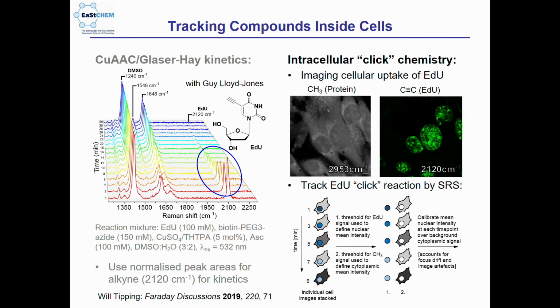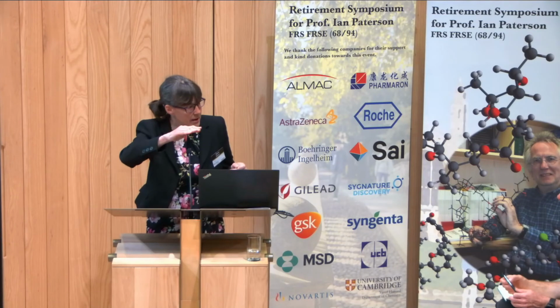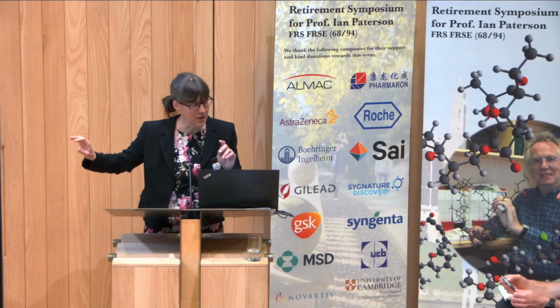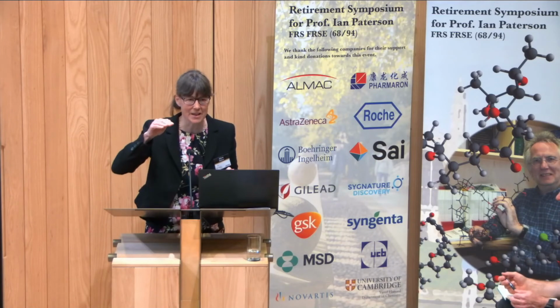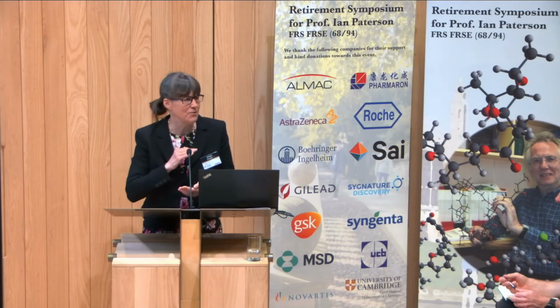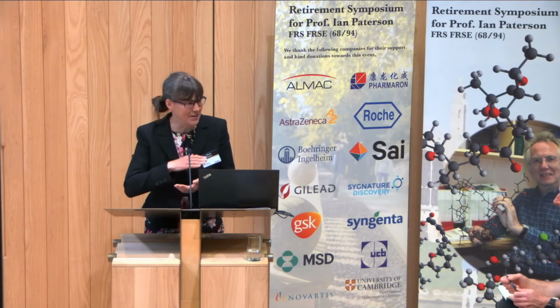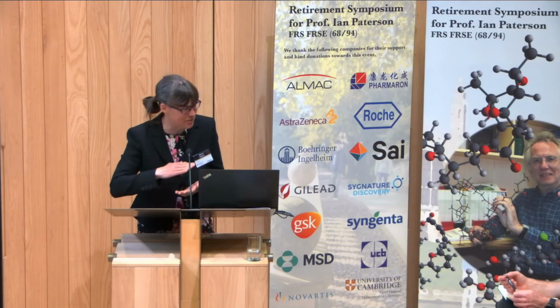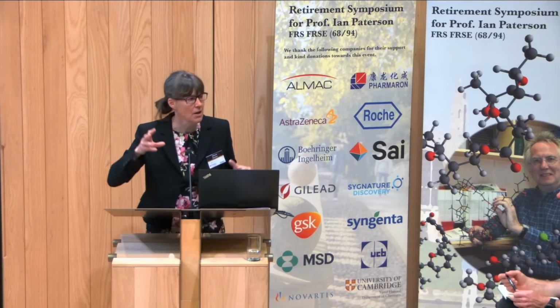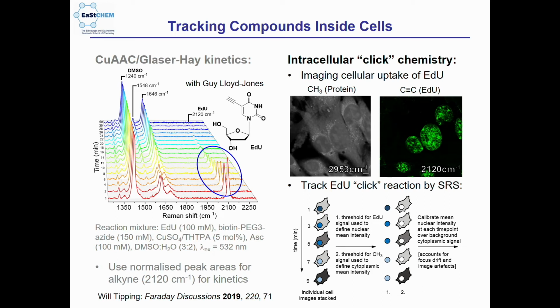So we can then track the kinetics by taking sequential images with time. I have put on the bottom of this slide, I won't take too long on it now, but it's not quite as easy as just stacking them and seeing how fast the signal goes, okay? Because you get focus drift, alignment issues, and intensity issues sometimes from your laser fluctuations or whatever. So we have to do a bit of background correction using the CH3 signal from the cytoplasm in order to background correct and sort out the data.